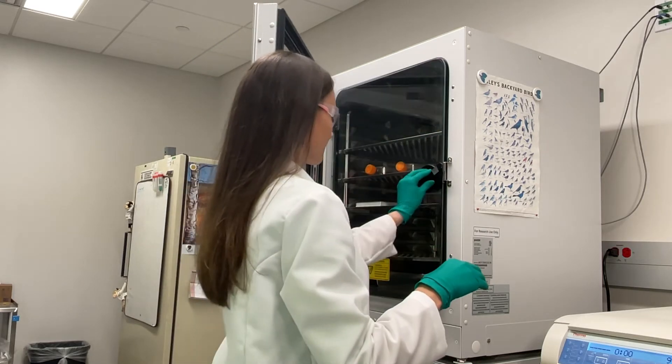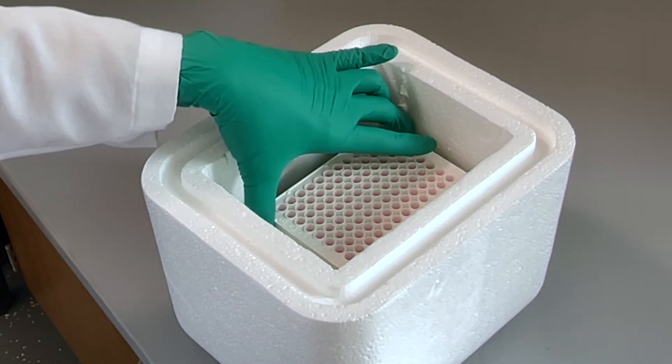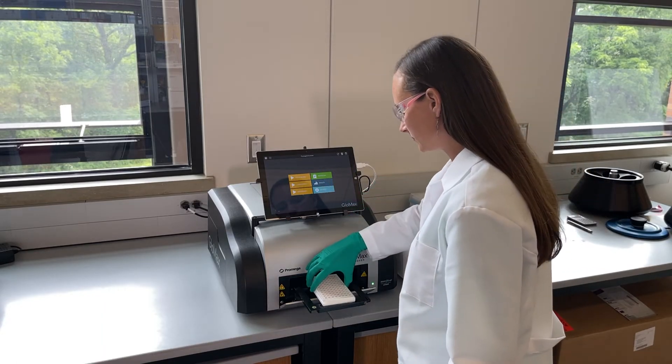To minimize temperature variation when going from the incubator to the plate reader, I pre-warm a styrofoam cooler with a gel pack at 37 degrees Celsius. This keeps my plate at the right temperature until I can get it into the plate reader.